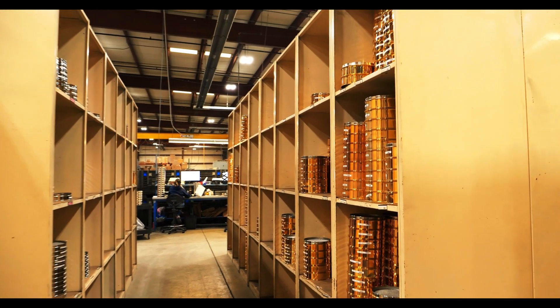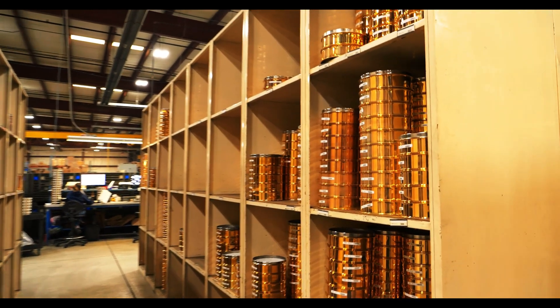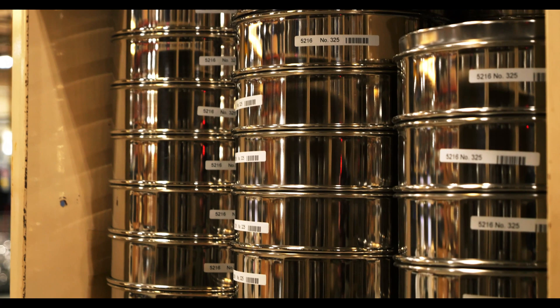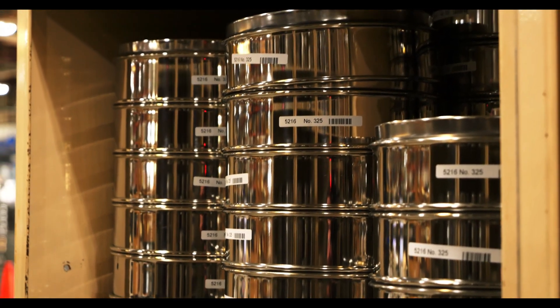Test sieves need to be stored in a clean, dry, and controlled environment. In order to keep the sieve in its optimal condition, it cannot be stored in a wet place or in a rapidly temperature-changing environment. This could damage the sieve, particularly the epoxy.